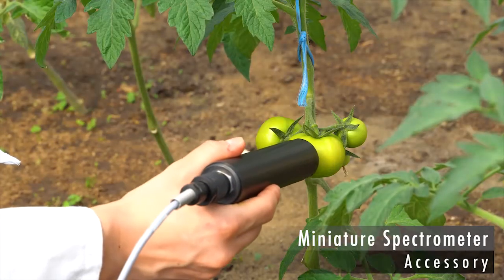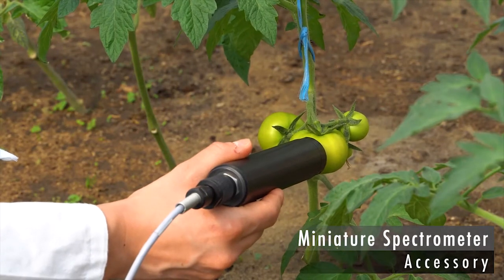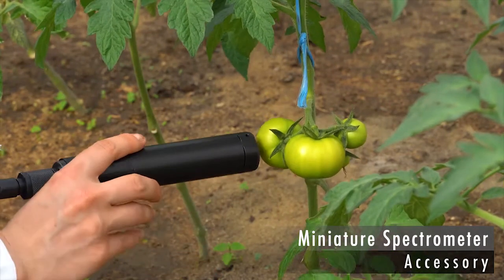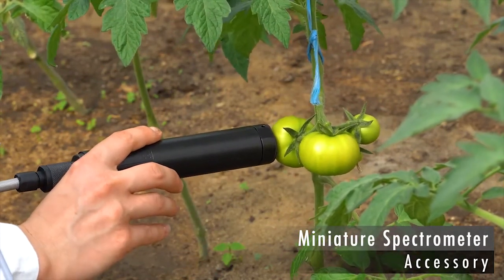Without the magnetic sample holder, reflectance spectra of fruits can be recorded to monitor the progress of maturation.